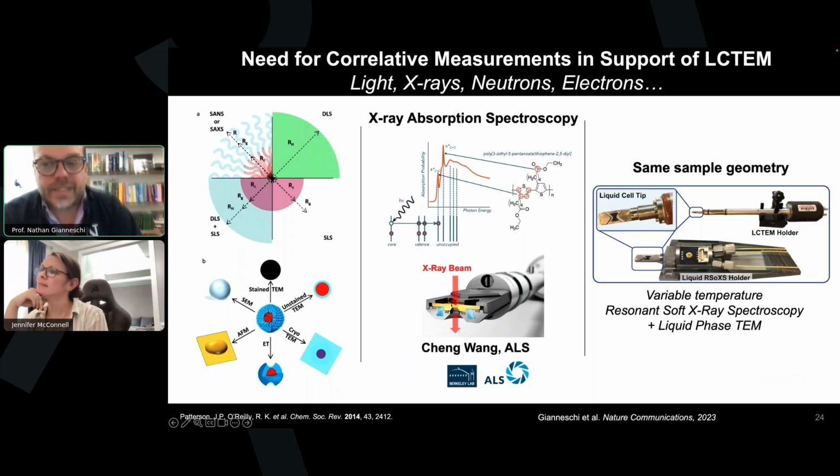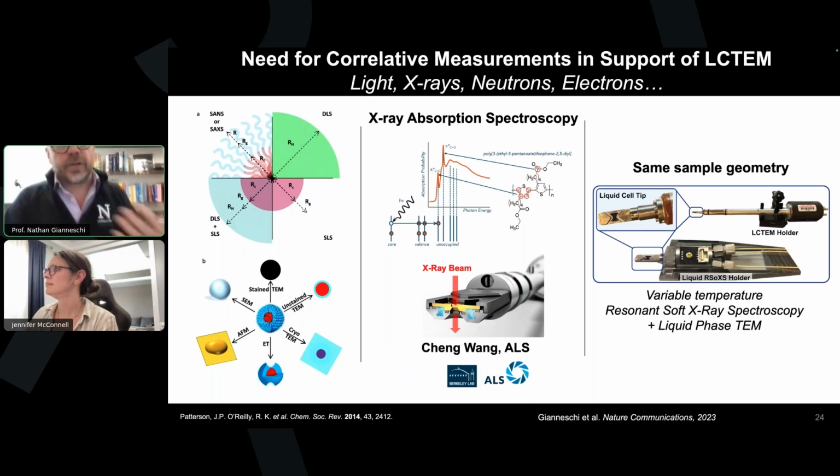And hopefully this answers it. Obviously there's a longer story, and I'm happy to talk to anybody about any of this, but like you said, maybe you're starting with a self-assembled particle or a polymeric nanoparticle or something that's on a reasonable length scale, right? That could be imaged by the method. So there are some physical constraints, right?